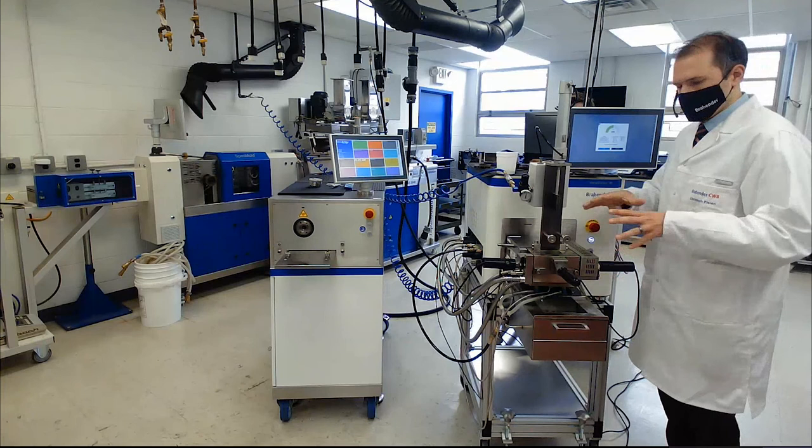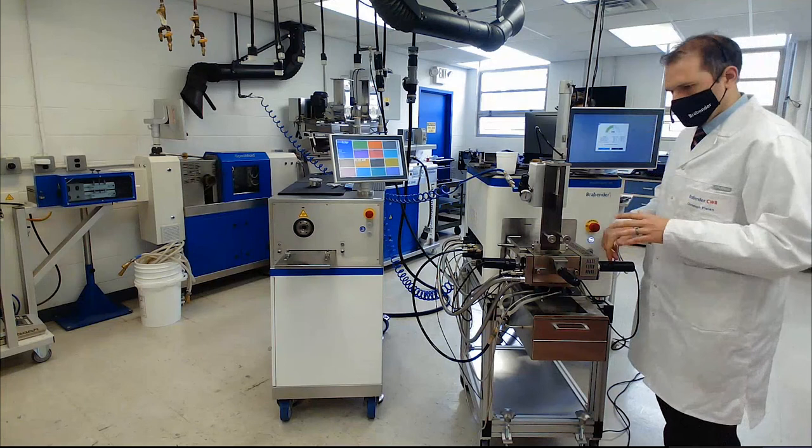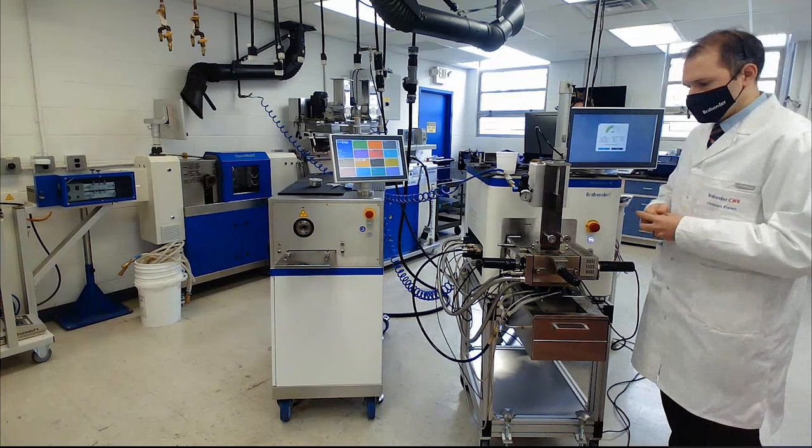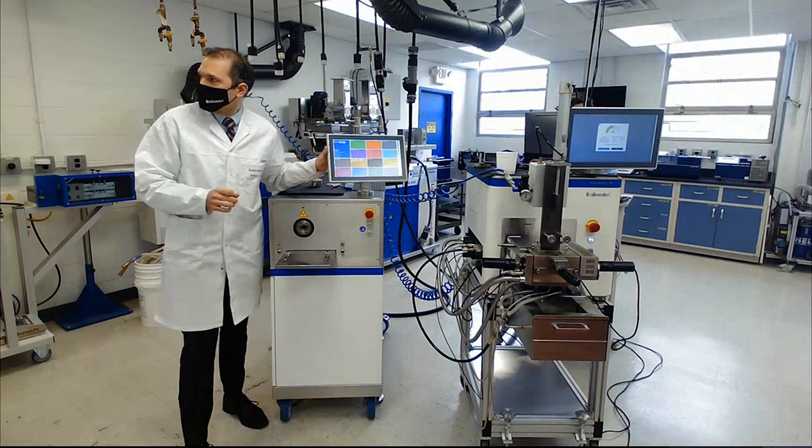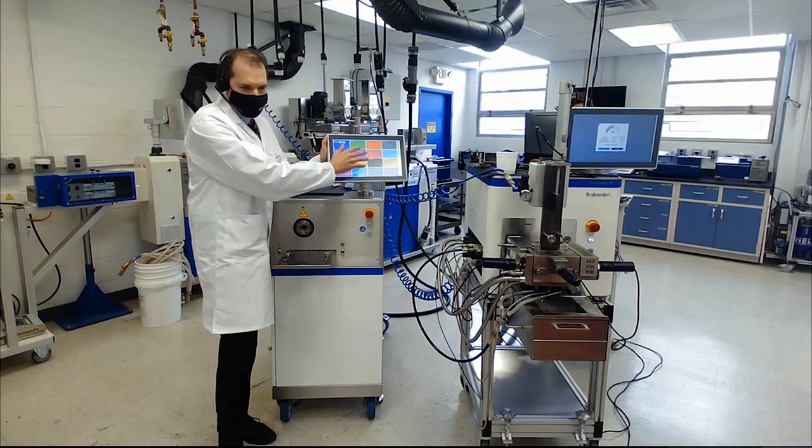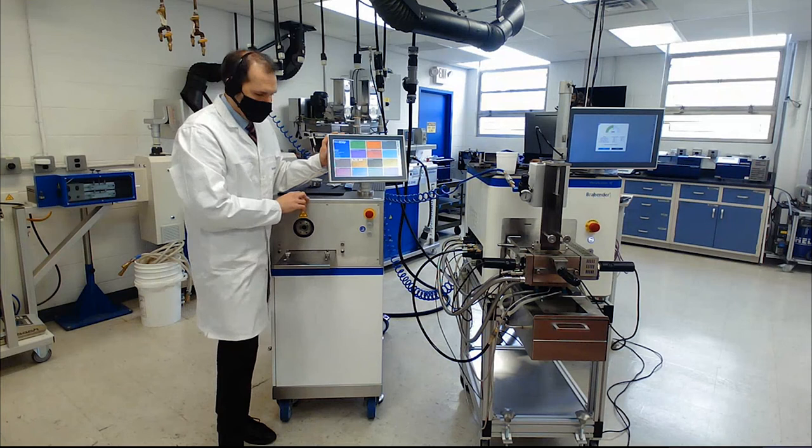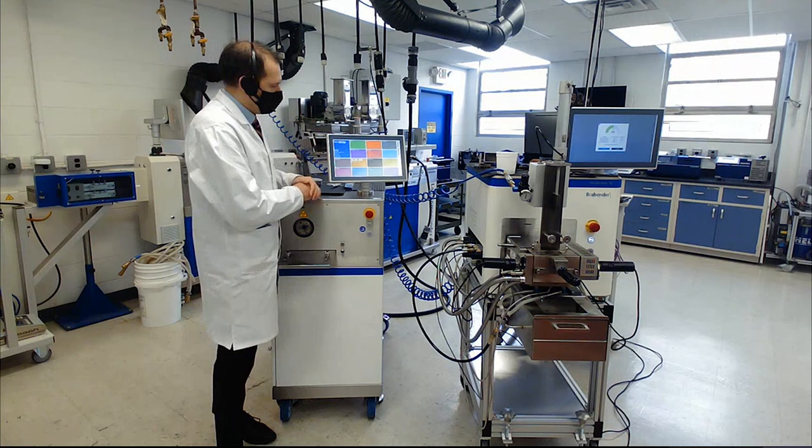From our software, because we only have like 50 minutes for doing this introduction, I will run the test and show you some features that will be unique to this new drive generation. As you can see here, the meta bridge is also loaded on my system for the metastation 8. It comes with this tile look where you have all the information and you can predefine methods for operators to just load. The algorithms for interpreting the torque response are all stored so any user can just select the material and the method they want to have it analyzed with.